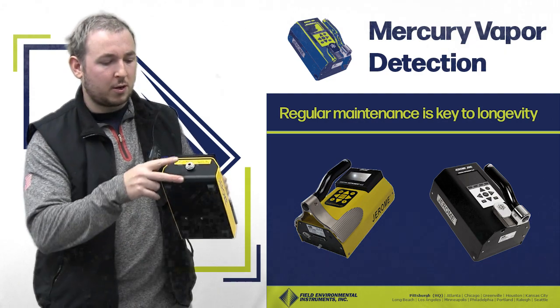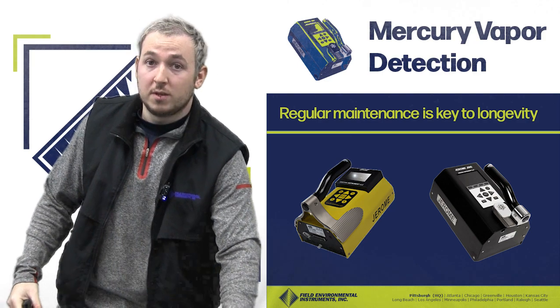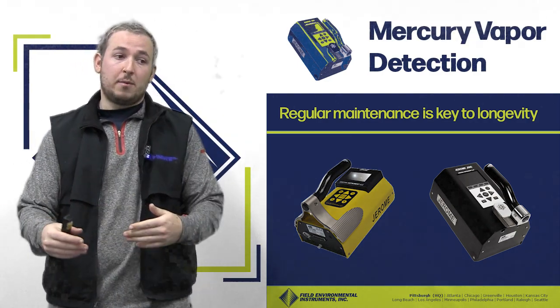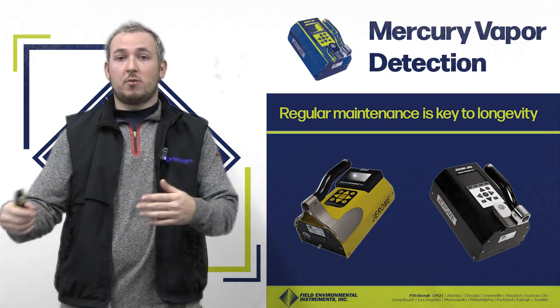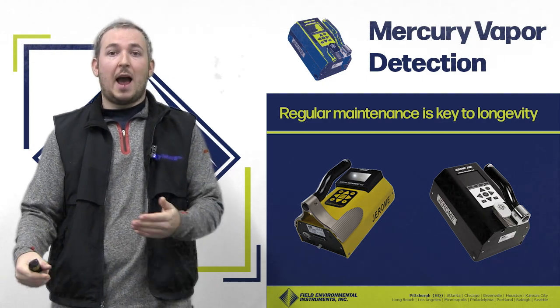Other things to think about are changing filters as you need them. There are small filters that go right in the tips of these that you can change yourself. There are also 0 filters that we'll send with the units, so you can take a 0 in between samples or before, at the start of your day or at the end of the day. I always recommend zeroing your unit before sampling though, just to make sure that you're getting accurate samples.